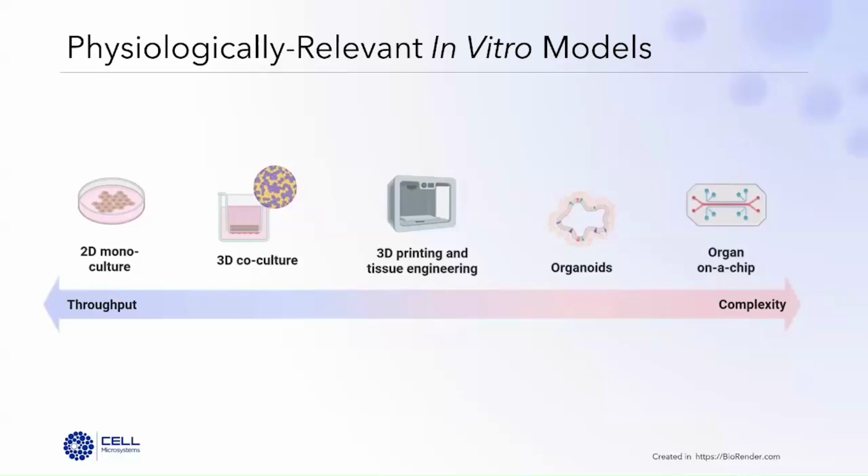So for the purposes of today's webinar, I'm going to be focusing on 3D model systems that offer the greatest potential for utility to be used throughout the development process because they marry the benefits of throughput and physiological relevance.